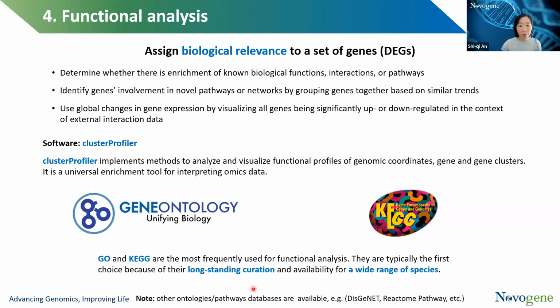However, if you're studying human-related transcriptome analysis, then there are other ontology and pathway databases that are available. They're more specific. For example, there's DisGeNET and the Reactome pathway database. So they also offer those databases for analysis as well.